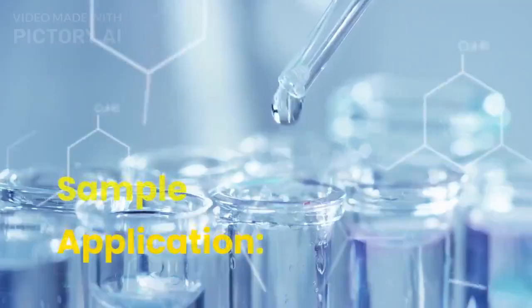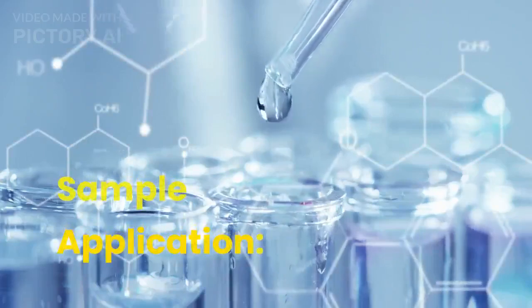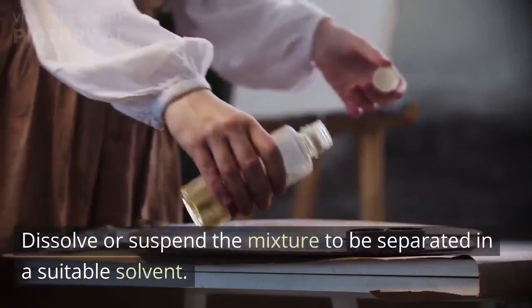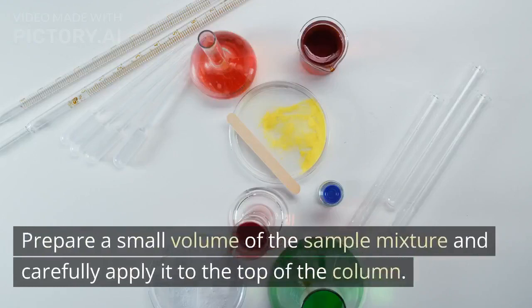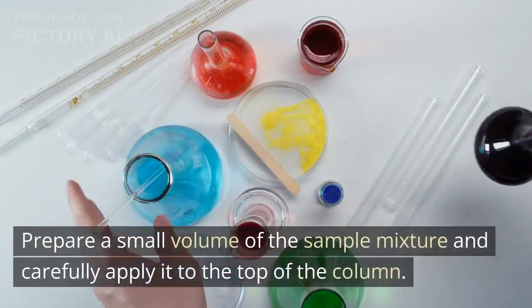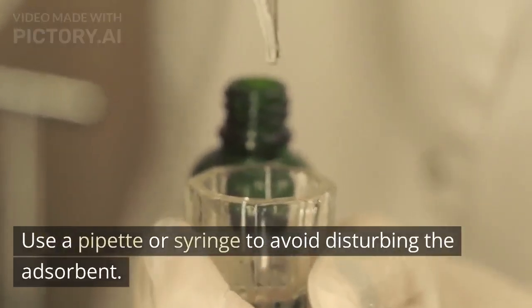Sample application. Dissolve or suspend the mixture to be separated in a suitable solvent. Prepare a small volume of the sample mixture and carefully apply it to the top of the column. Use a pipette or syringe to avoid disturbing the adsorbent.